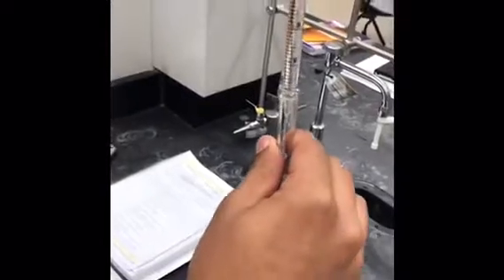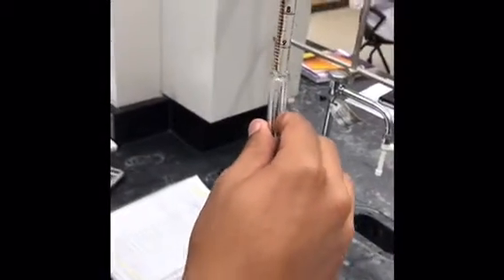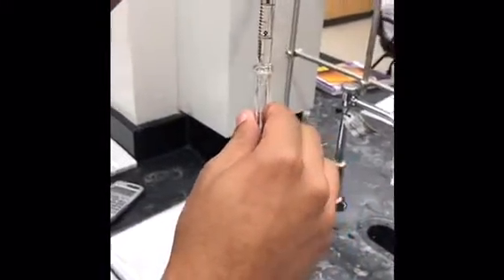So here I'm taking 10 milliliters of the 20% stock, the initial concentration. Now we're going to put it here in the concentration flask. So we are going through the process of diluting, so we can find the next concentration of our liquid. For finding it, we're going to base it on a formula that I'm going to present in a few minutes. We leave the 10 milliliters here and dilute the rest with water.